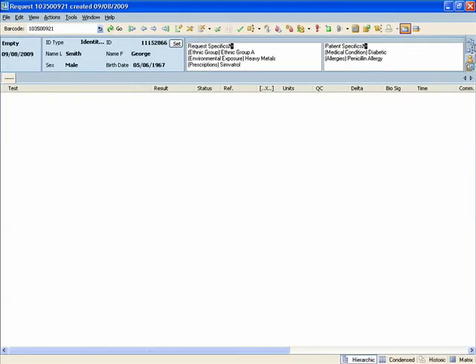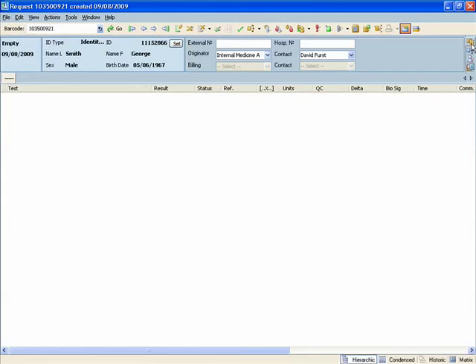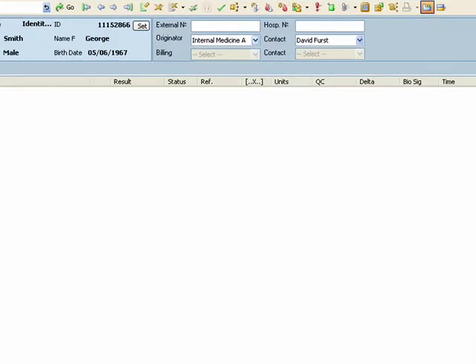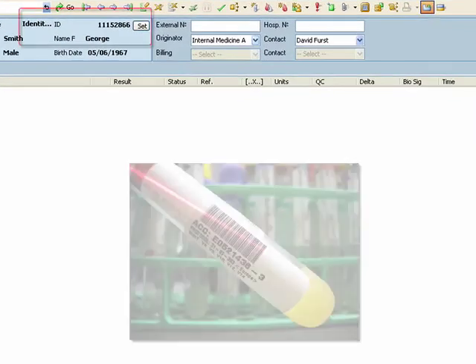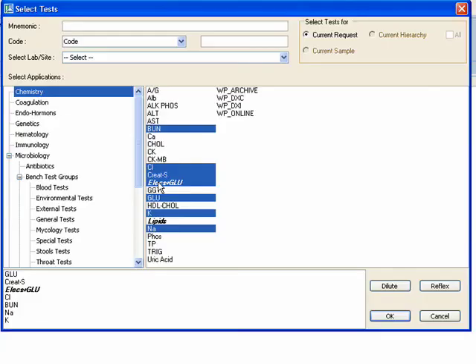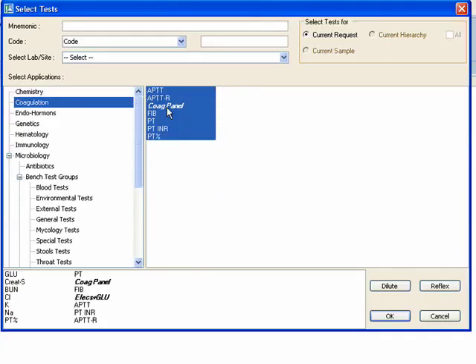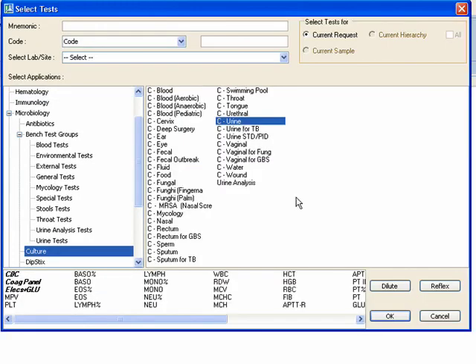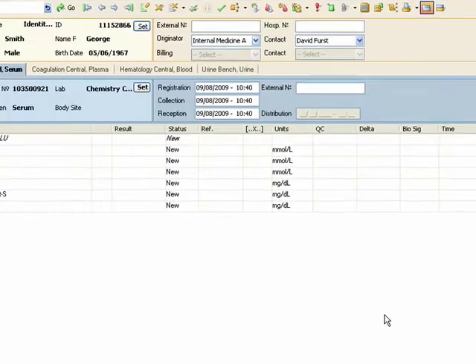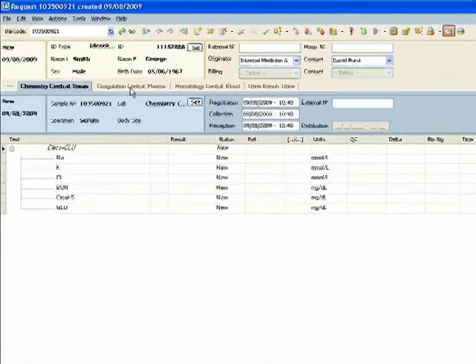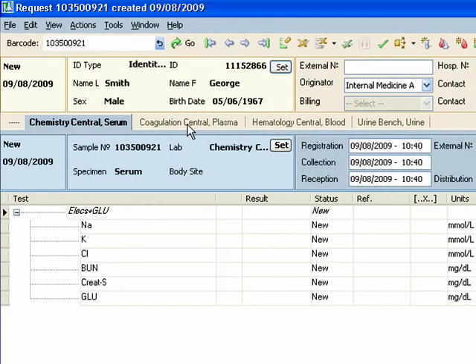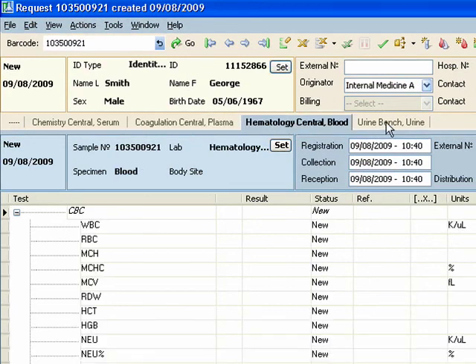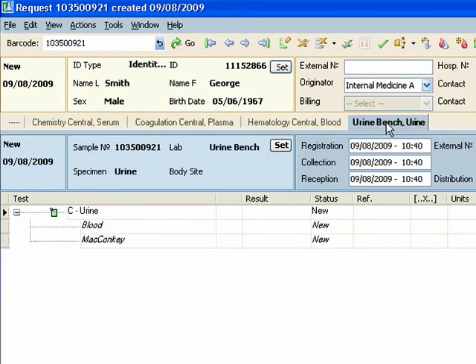Minimum requirement for ordering a request is an ID or barcode number and the test selection. Orders can produce different samples in different laboratories. The samples are clearly displayed with individual tabs and are associated with the same request. Access to the detail of tabbed samples is allowed or restricted according to lab staff permissions.